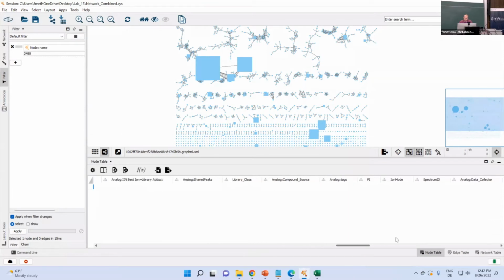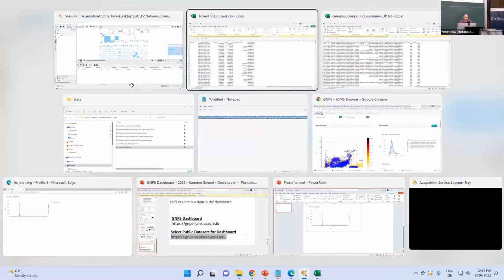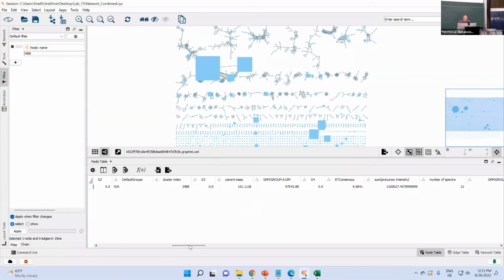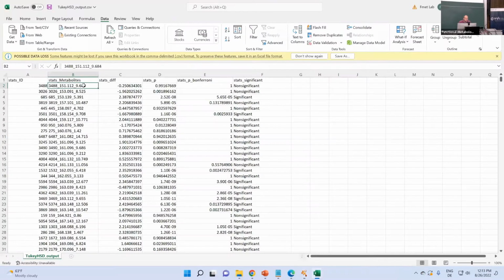Let's actually see what 1118. 1112. What is that? But the retention time 968. Maybe it did some weird rounding here.